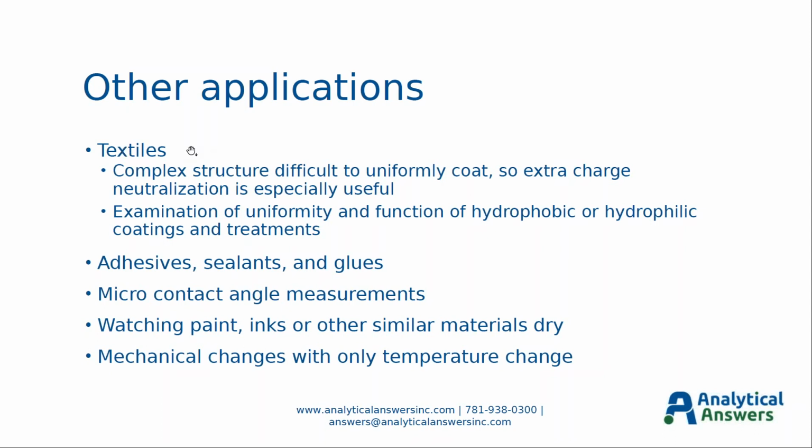We do have a lot of other applications this could be used for. The first one is textiles, although the list is almost endless. The reason it's good for textiles is that the complex physical structure is difficult to uniformly coat, so the extra charge neutralization that you get from this is especially useful.